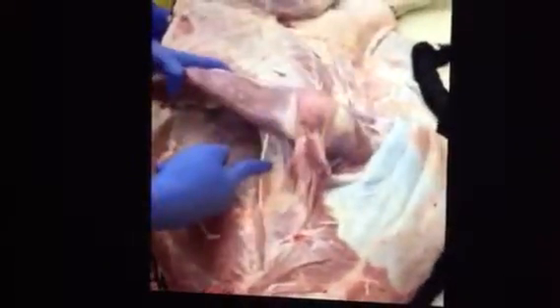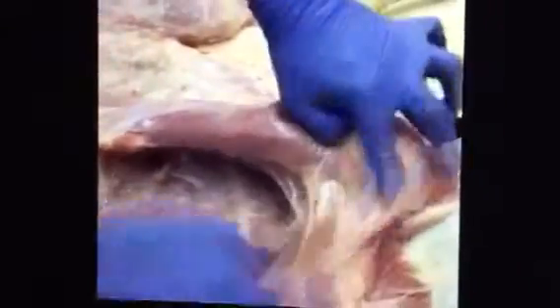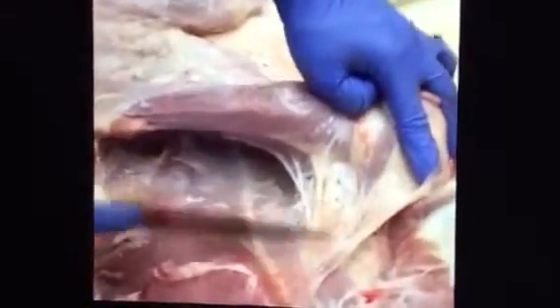Under the scapula, you find the brachial plexus, which is a network of nerves to the brachium. The white cord-like things is the brachial plexus. Right here.